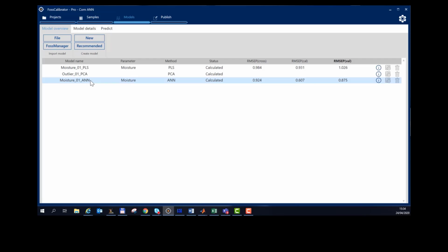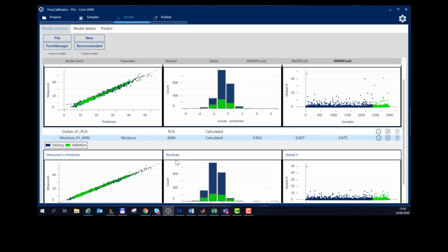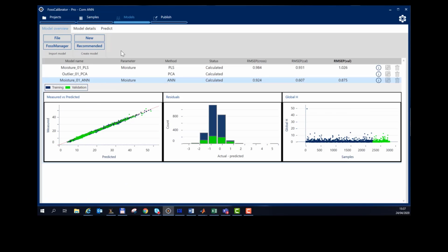If we look on the 2 graphs, we can have them side by side. We can still see that the ANN performs quite well compared to PLS. It's more struggling in the high region, even though a lot of samples are well performing. Remember that I choose not to use scatter correction. Let's see if my assumption based on previous experience was right for this data.